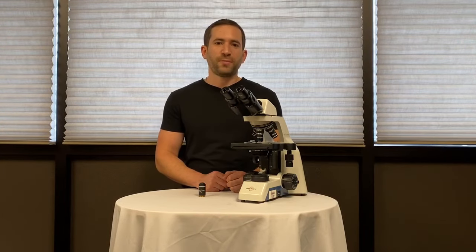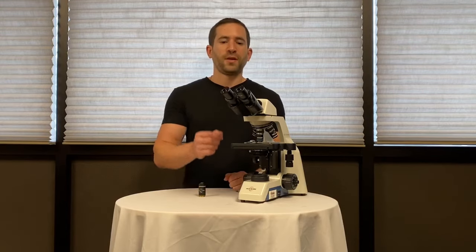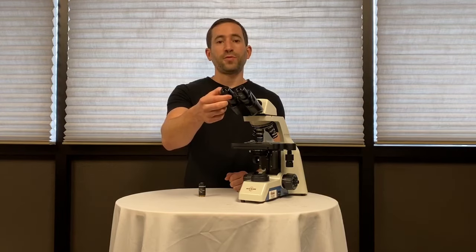The AccuScope EXC120 microscope is a great student-friendly microscope loaded with features. The 10X eyepieces provide an 18.5mm field of view and they lock in place to avoid tampering.